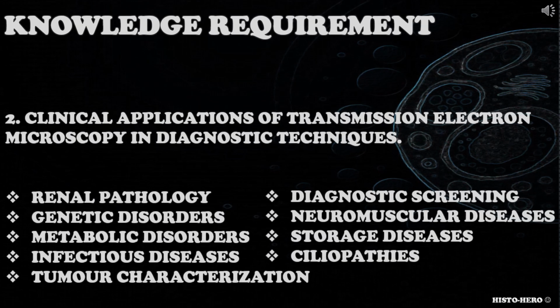The second knowledge requirement is clinical applications of transmission electron microscopy in diagnostic techniques. Candidate needs to have the knowledge and understanding about application of TEM. You could ask the candidate to explain what is TEM and how it works, to name the clinical applications of TEM in diagnostics, name diseases that can be diagnosed or investigated using TEM.